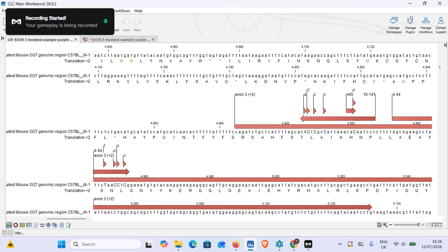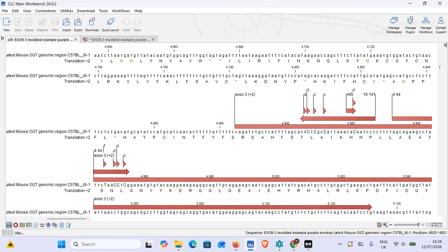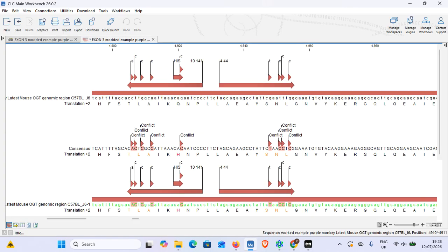Okay, and we're back. I know you're probably heartbroken that you missed the riveting text editing that I did, but as you can see in this modified version of the region, I've changed the lowercase to uppercase as well as changing the letters. And yeah, at a casual glance, you won't be able to tell that I've done it correctly, but first, you could trust me, and secondly, let me show you an alignment that I've just done of the native region up top versus the altered region.